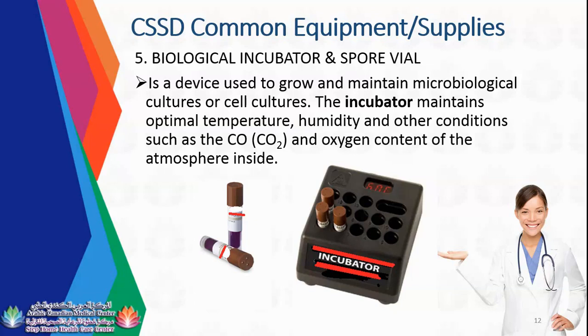It's a device used to grow and maintain microbiological culture or cell culture. The incubator maintains optimal temperature, humidity, and other conditions such as CO2 and oxygen content of the atmosphere inside.